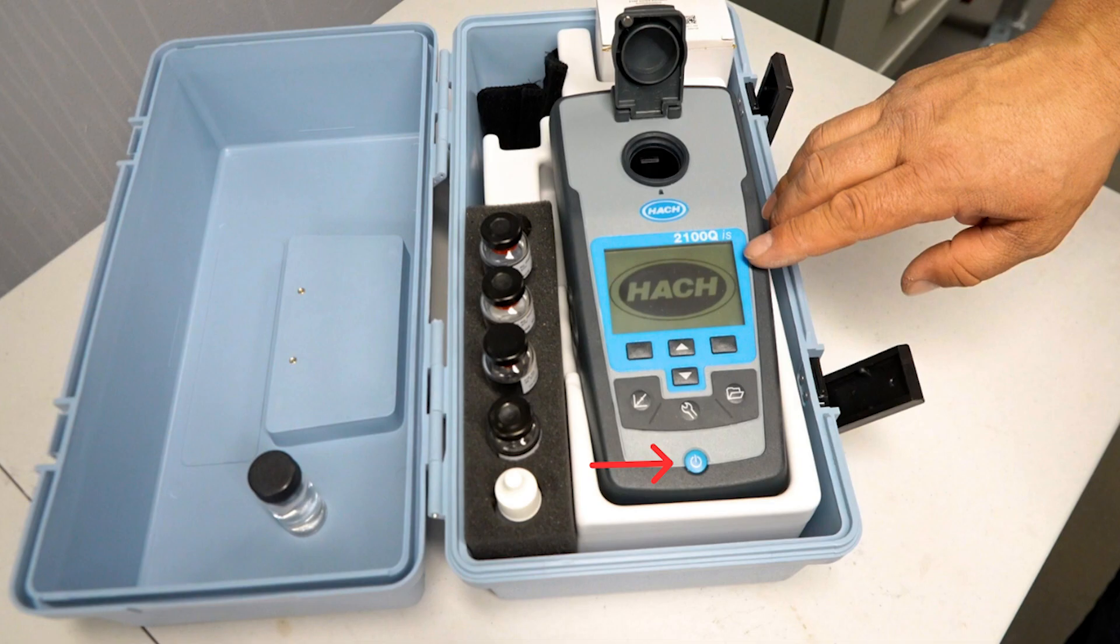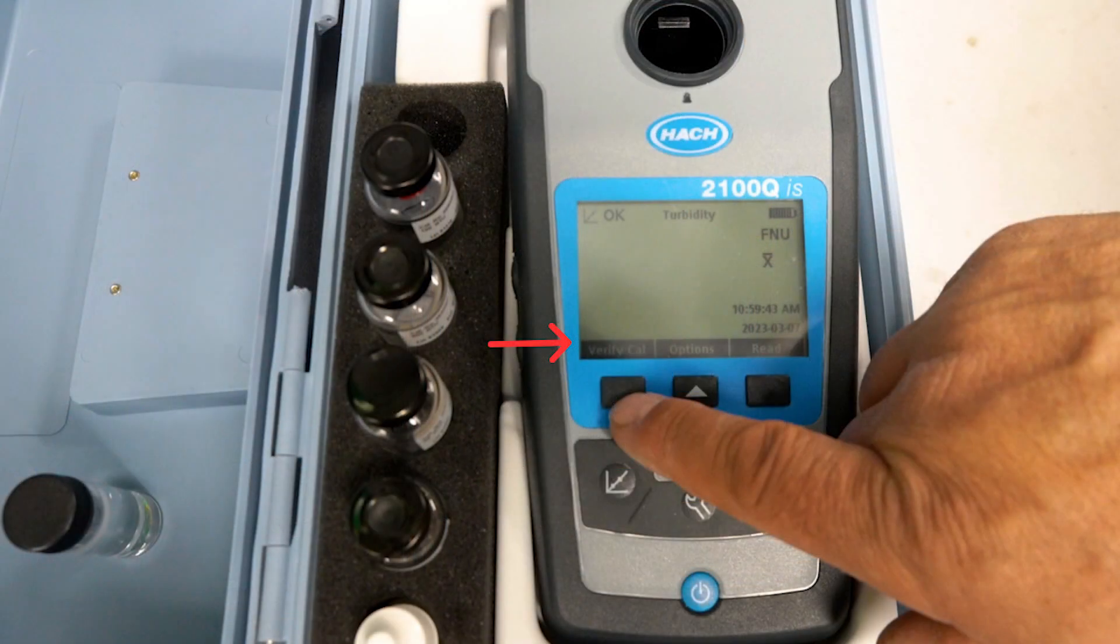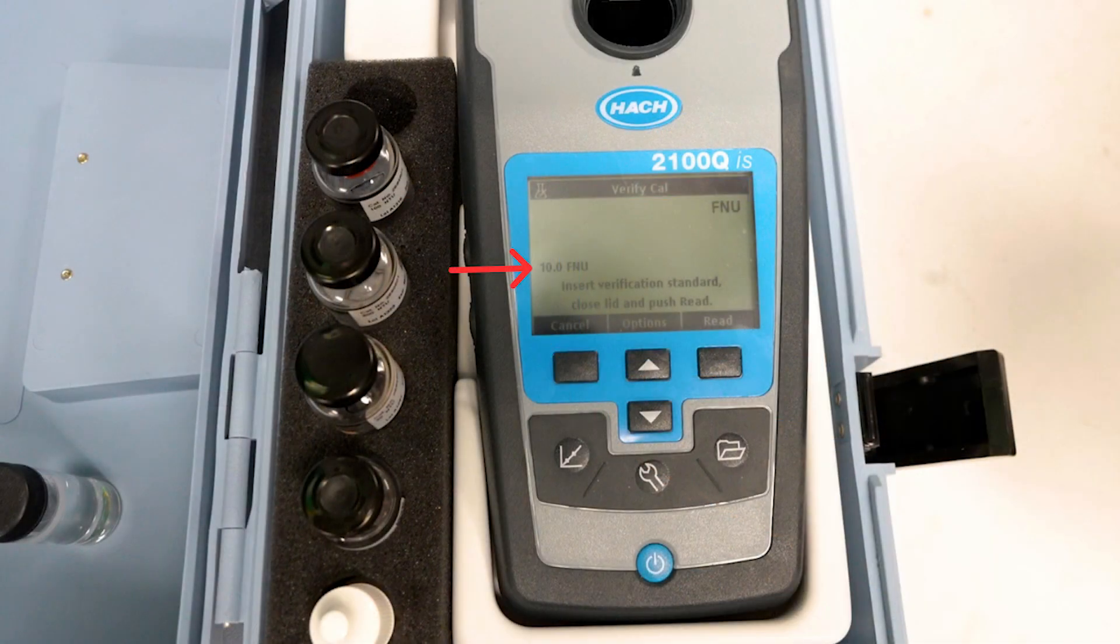So first of all we've got to turn the power on, and before we do a calibration we do verify calibration. So we hit this button, and then it asks to put in the 10 FNU, which is the American version of NTU. So when you're ordering these things make sure you get the metric or the imperial readings for them.